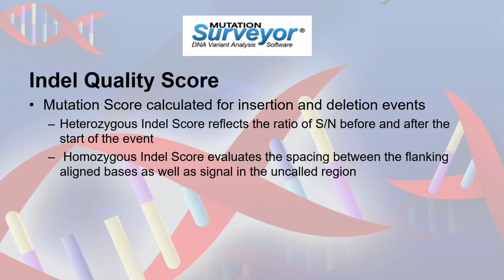The Indel quality score is the mutation score that is calculated for insertion and deletion events. For heterozygous indels, a heterozygous indel score is calculated using the ratio of signal to noise before and after the start of the event. A homozygous indel score is provided for homozygous indels, and this score evaluates the spacing between the flanking aligned bases as well as signal in the uncalled region.